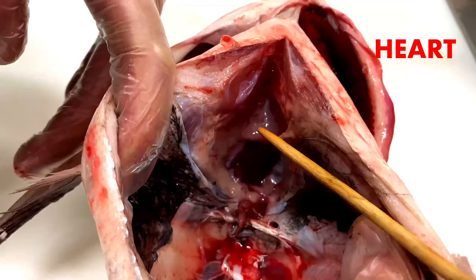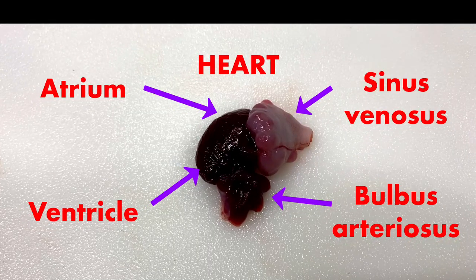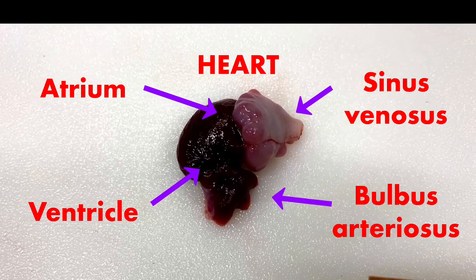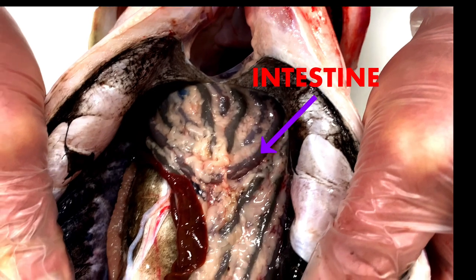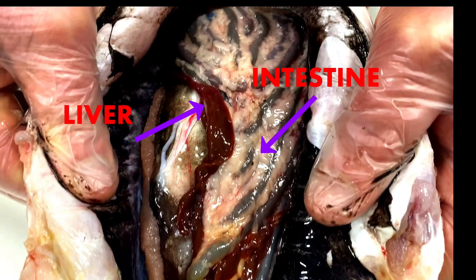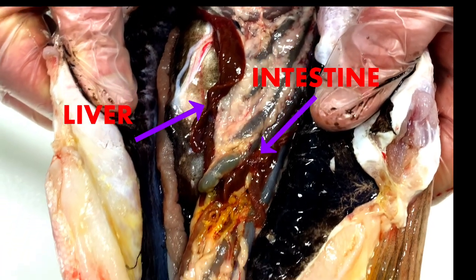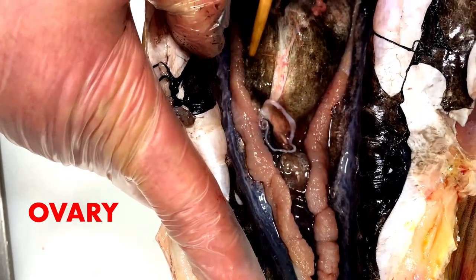Blood flows into the heart from the sinus venosus and moves into the atrium and then the ventricle, which pumps the blood through the bulbous arteriosus to the rest of the body. The silver carp lacks a stomach — it's called an intestinal swelling. The liver is the brown tissue under the intestines. The digestive tract can be five times the total body length of the silver carp.